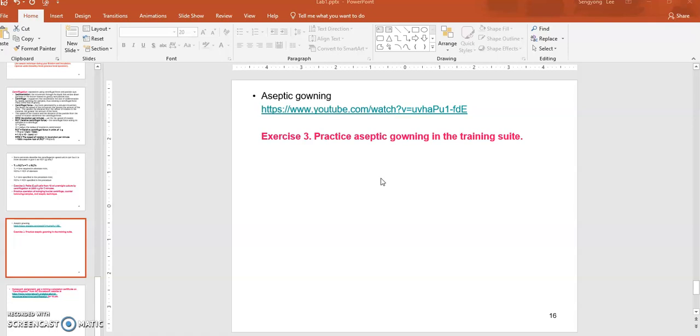Of course, that's after your gloves are put on, and then goggles and face mask, and finally another layer of booties and shoe cover that completely covers your feet, and then double layers of gloves.